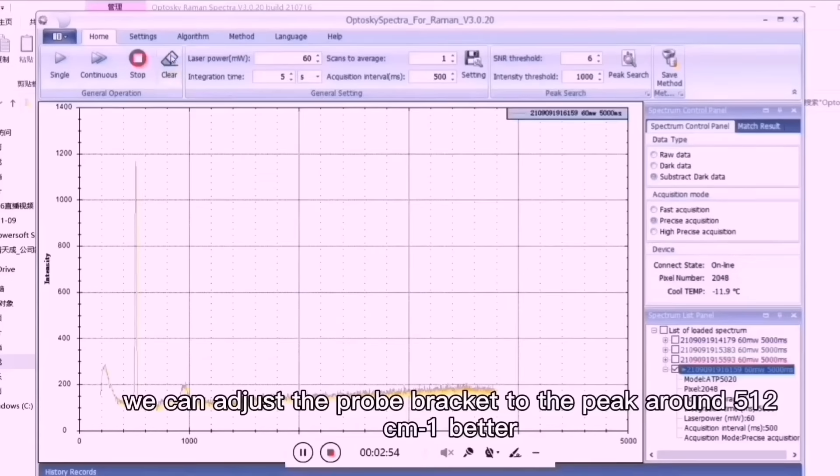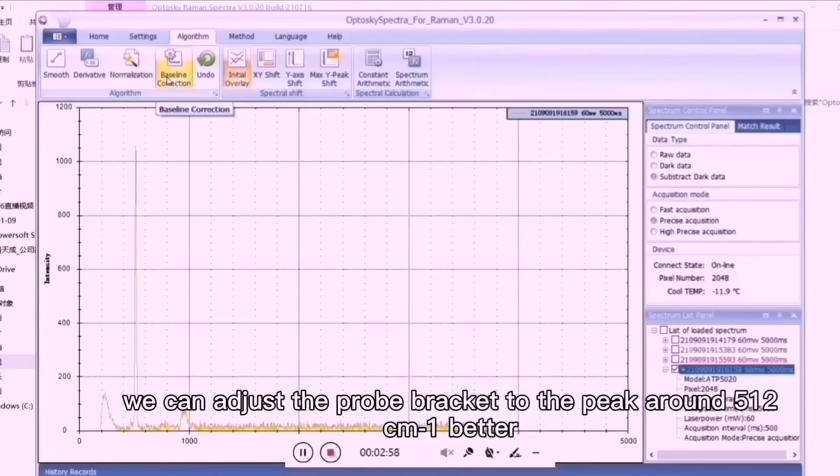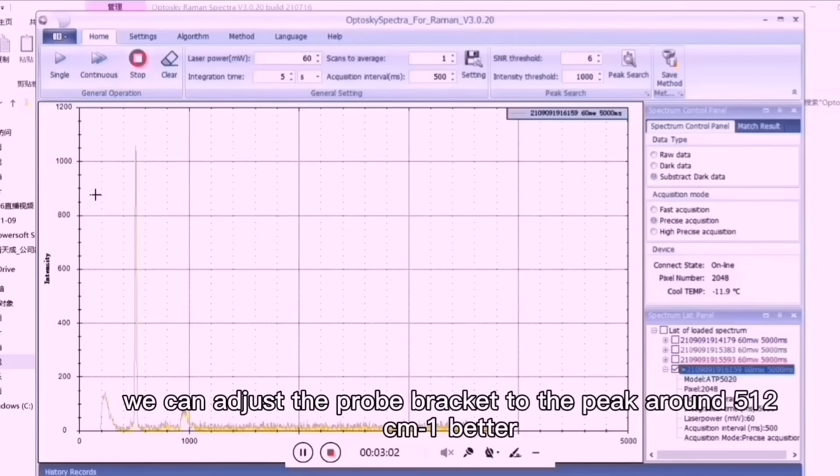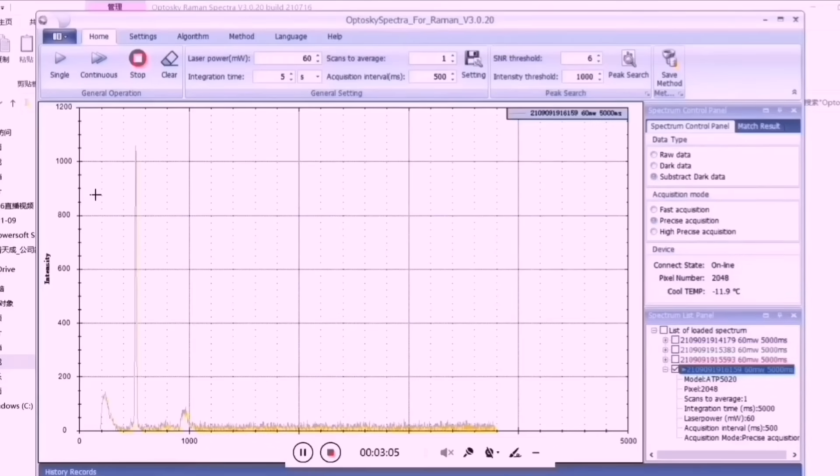We can adjust the probe bracket to align the peak around 512 wave number. The probe is fixed on the fiber level.